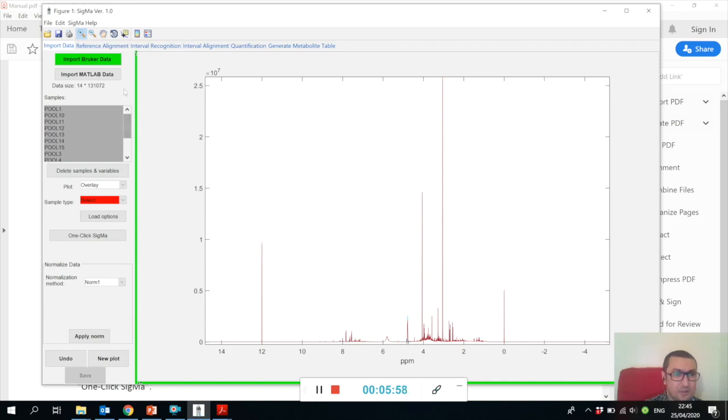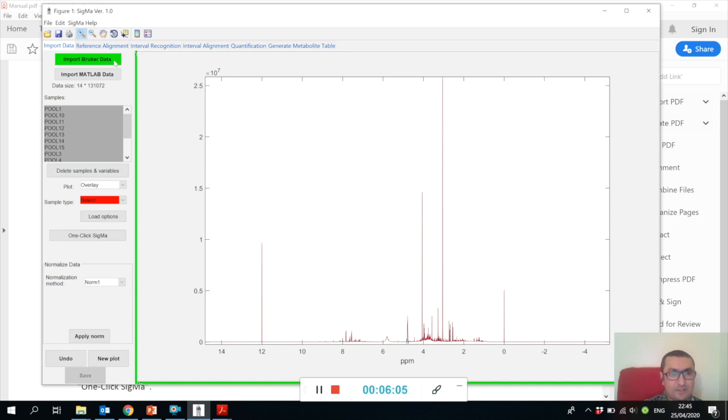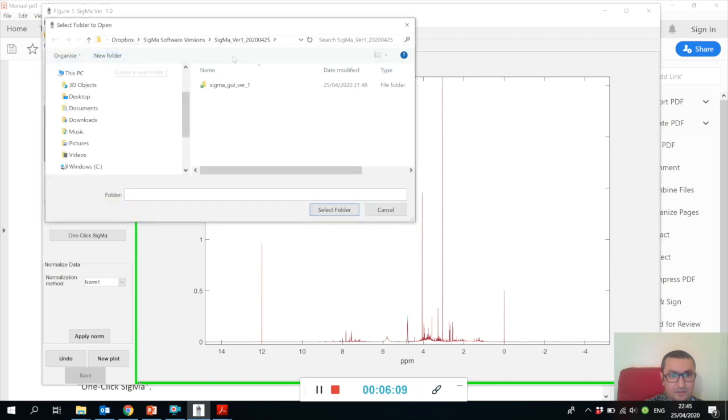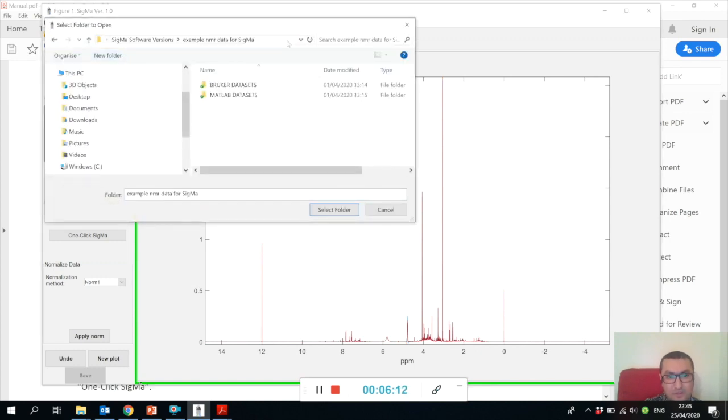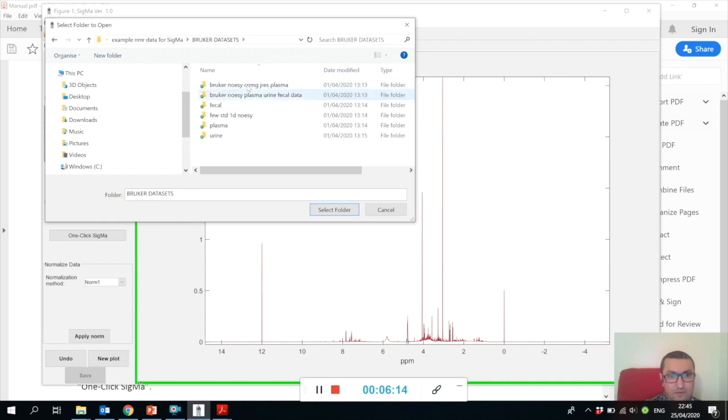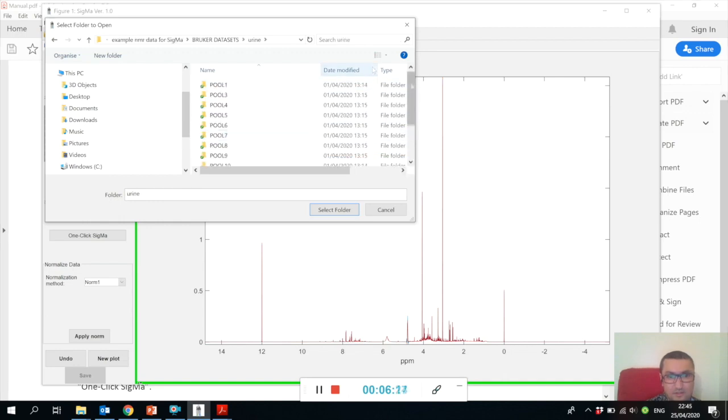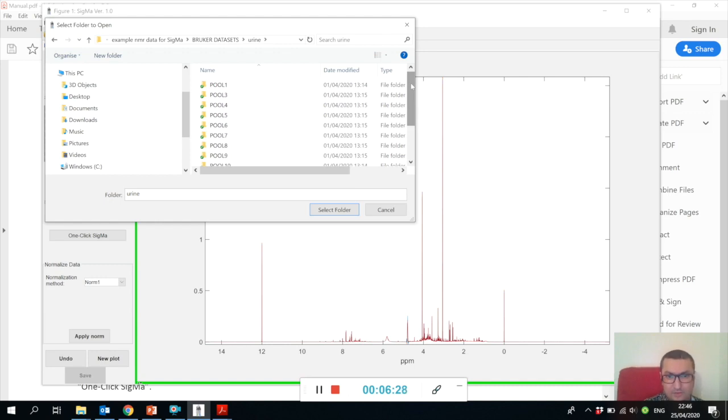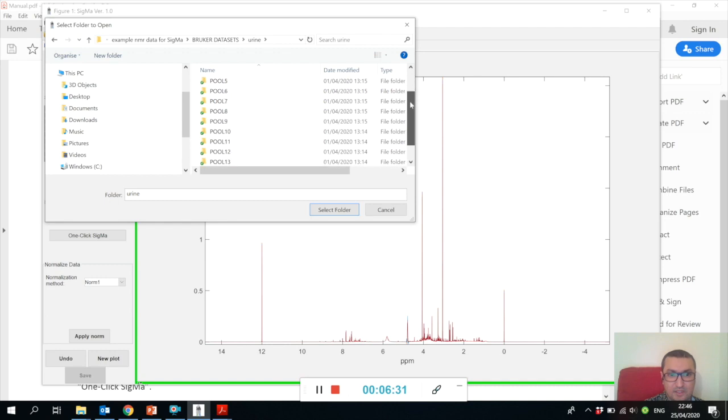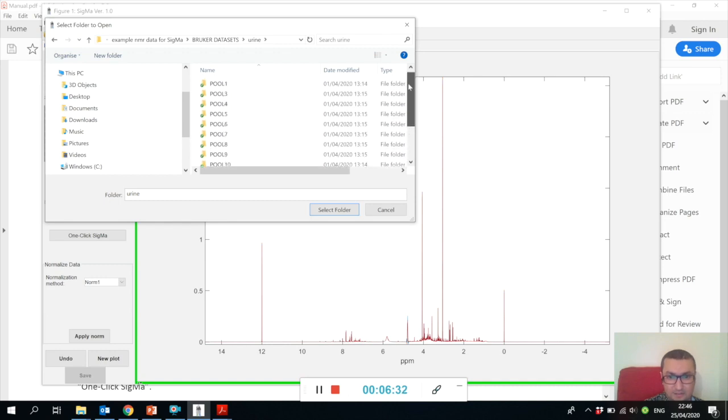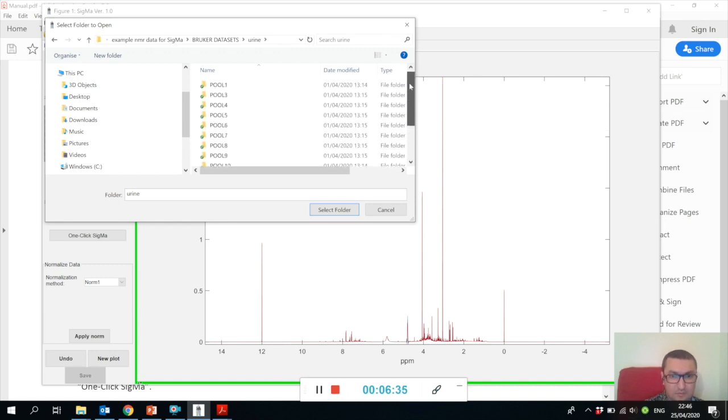Before you do anything, I would like to explain some of the difficulties which you may come across. Please make sure that when you import Bruker raw data files, in your folder that you direct, make sure that you have comparable NMR spectra - the spectra have the same size.